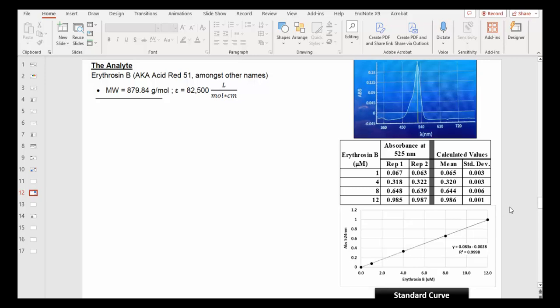So I'm just going to give you a little tutorial on how to add error bars to your curve. First of all, this is an example of, I think, a decently looking small table of the type of data that you had. Now, your concentrations are different, so your absorbances are different, your means will be different, but this generally shows a nice presentation of data for a standard curve.